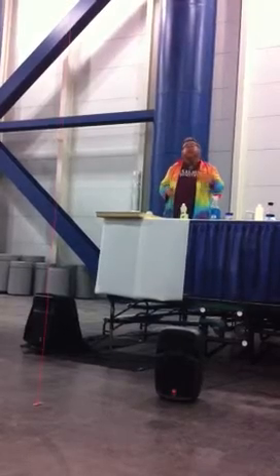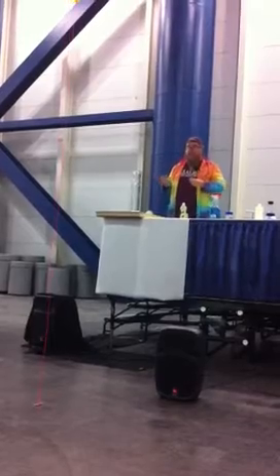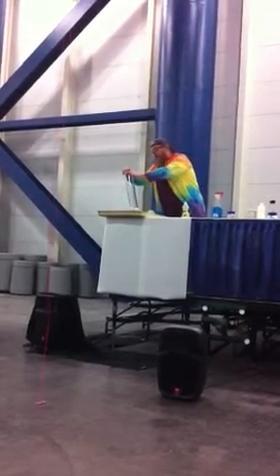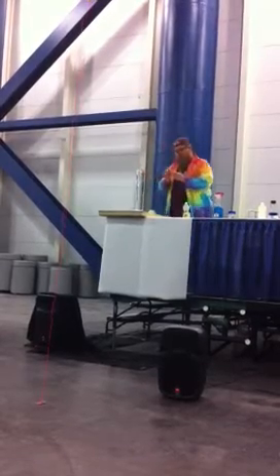Now the next thing I'm going to put in is some, again, the soap has nothing to do with the reaction, it's just going to help us observe it better. The next thing I'm going to put in is some food coloring, which also has nothing to do with the reaction, just makes it pretty. No reason your science can't be pretty. A little bit of red. And a little bit of blue.